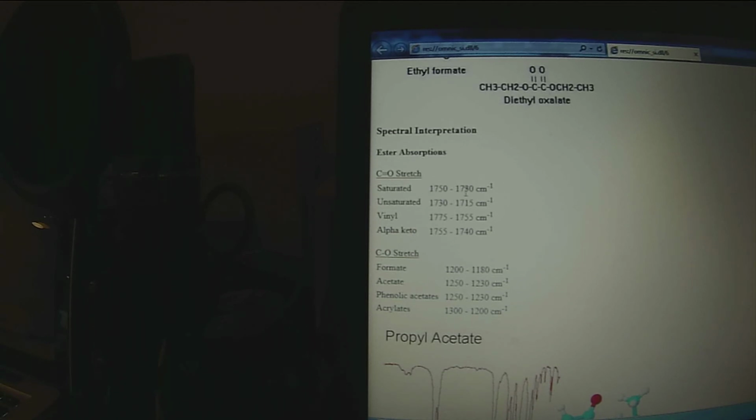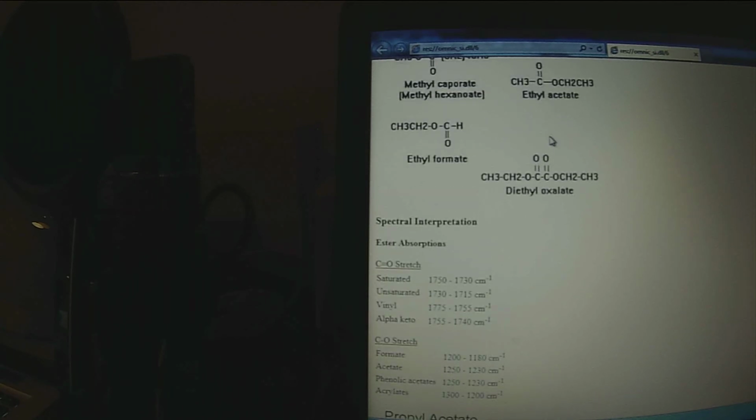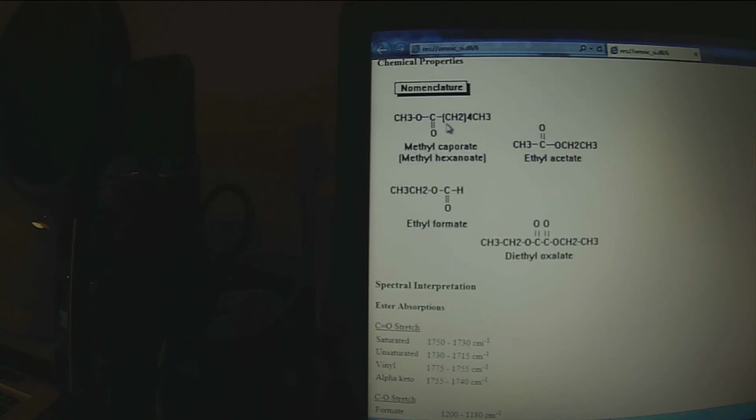So we know that that peak at 1735 is present because of a carbon-oxygen double bond stretch, which is a functional group that we have in our ester, right? Ours doesn't look quite like this. Ours has a 12 carbon, or 13 carbon chain rather here, plus the carbonyl, which is 14, and not a CH3. Ours has a glycerol there, but it's still an ester.